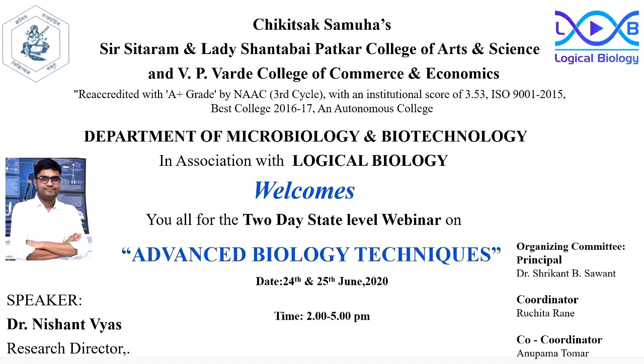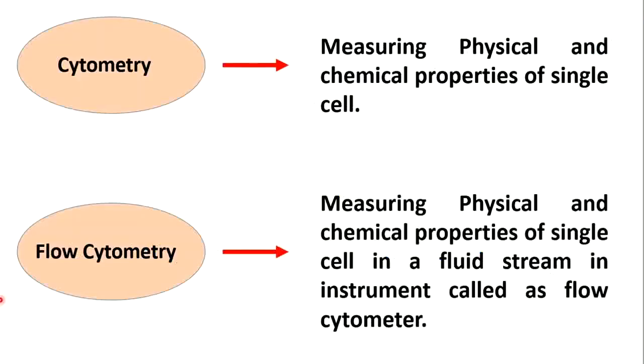So in this 2-day schedule, today I am going to mainly discuss flow cytometry, multicolor flow cytometry and its applications, and tomorrow we are going to discuss cell culture and the real-time PCR based system. So let's start with the discussion.